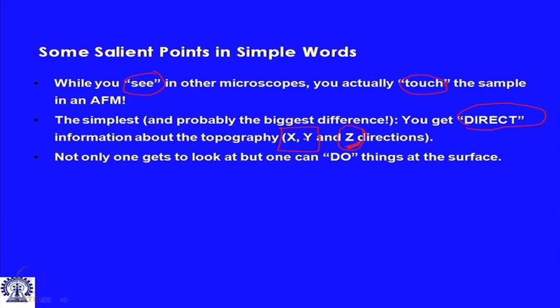And since you have the ability to touch the sample, you can do things on the sample, which include that you can pattern it, you can dispense on it, you can indent it, or you can even dislodge molecules and do whatever you want to do.